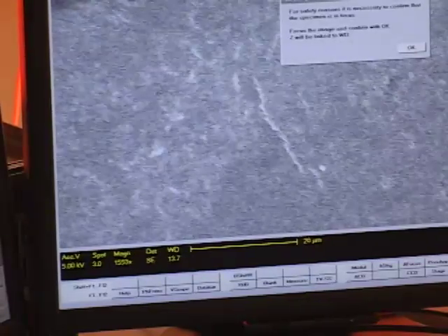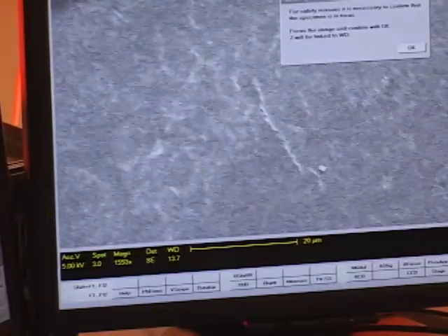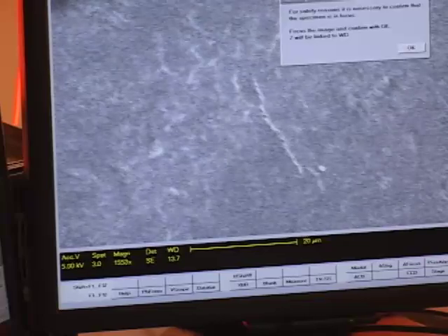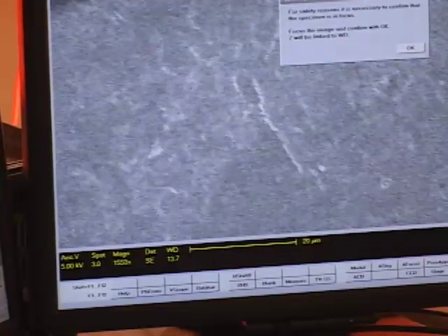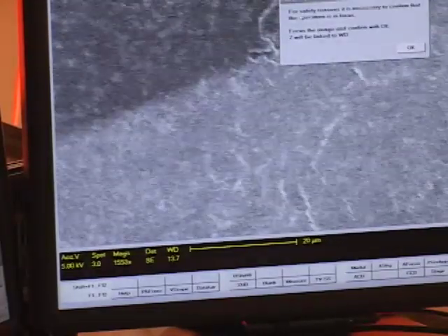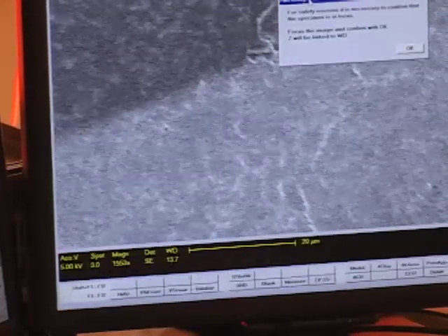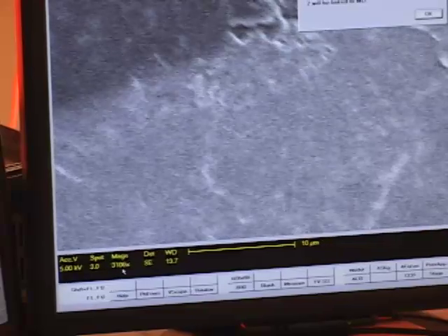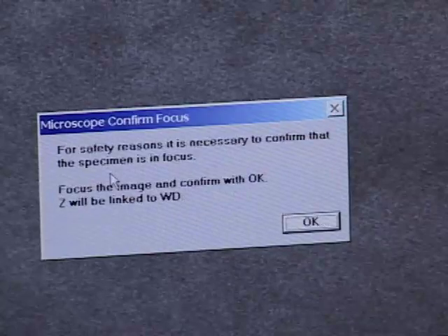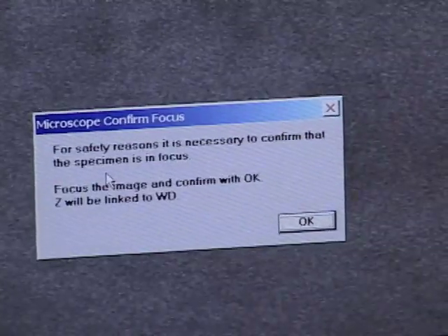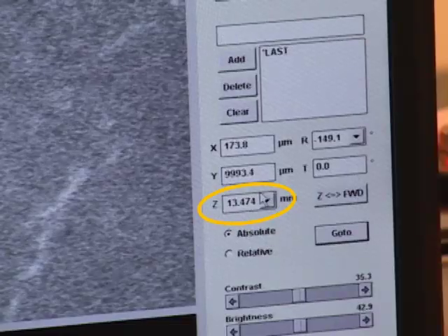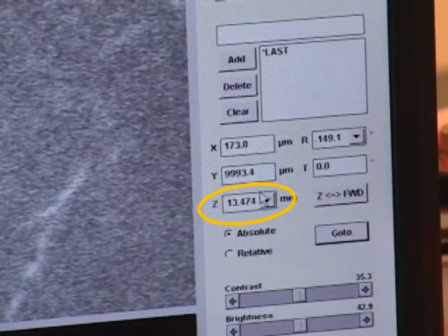So I'll magnify one more time. I'm now at 3,100, over 2,000. I get the best focus I can and now the working distance reads 13.5 millimeters. This is an accurate measurement of how far the sample is from the pole pieces. So I'm going to calibrate that height of the stage by clicking OK in this box. You can see that it transfers the working distance into the Z coordinate over here.